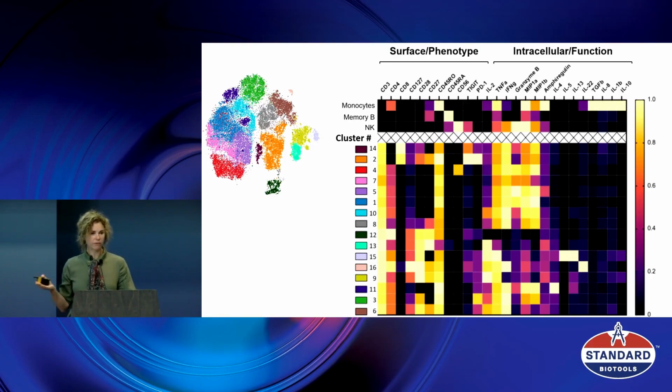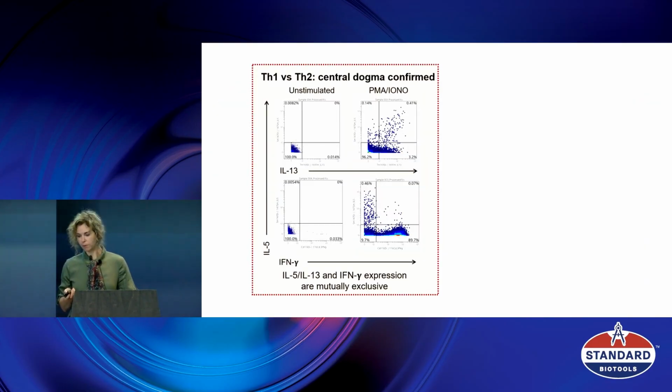And I have the most recent data set that I saw. I saw my iNKTs there because we easily could collect 500,000, 1 million events from the sample, and then I concatenated several samples, and I could see the iNKT population just nice and clear there. So that's actually one of the weaknesses of mass cytometry, I think, going away: the limitation of the cell numbers that you can assess from one panel, okay?